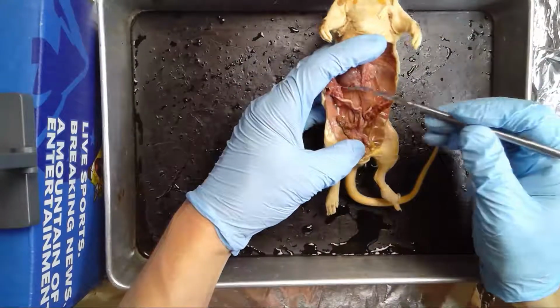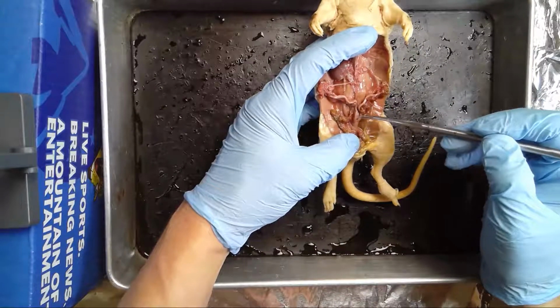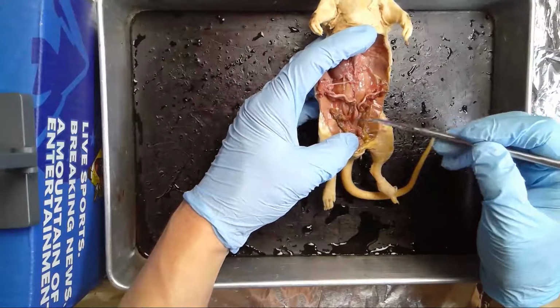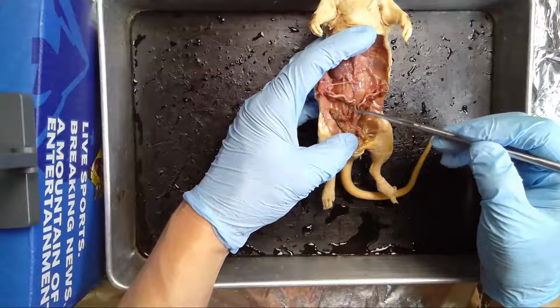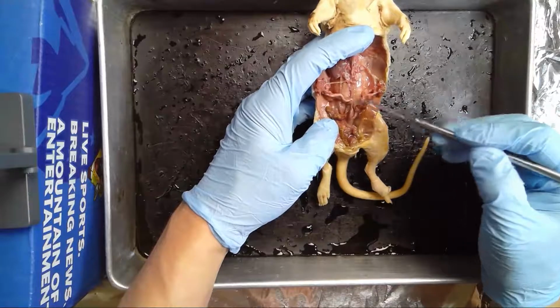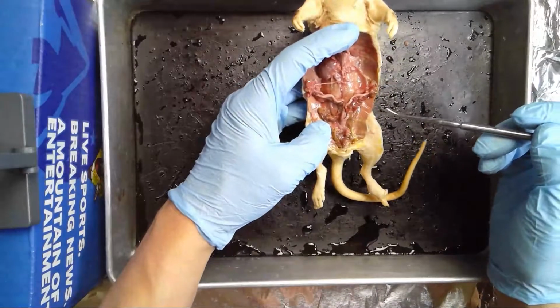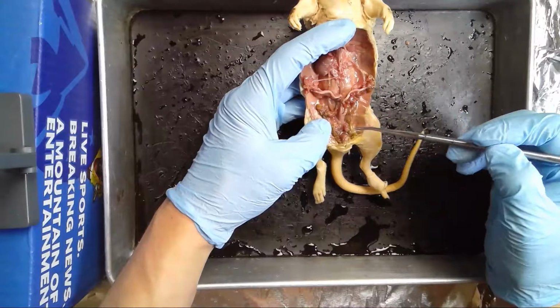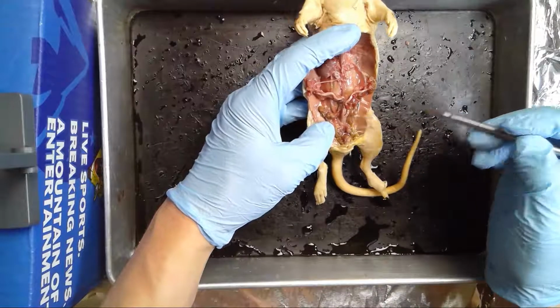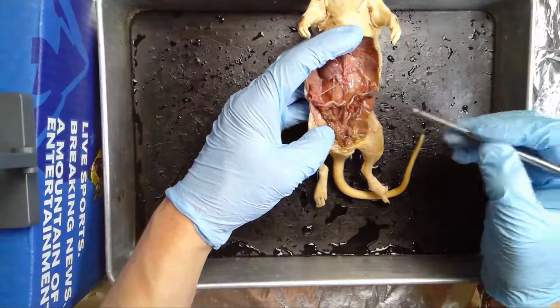So you could imagine that there might be a number of fetuses all developing on both sides. And then when it's time to give birth, or closer to time to give birth, those move down towards the vagina and they come out. Okay, so it's a little bit different in the fact that they can have so many pups. And I think that's about it. That's it for the female reproductive organs of the rat.